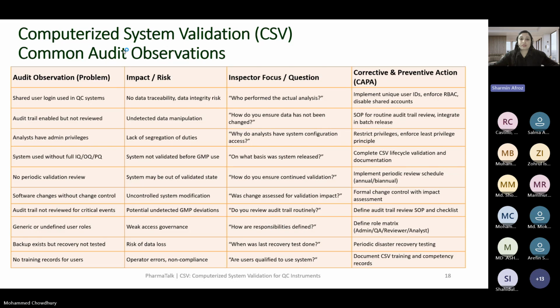And for the audit trail, like policy change and user management change, there will be logs and audit trails, and they put the reason in the audit trail, and it can be routinely checked by QA or the person responsible for audit trail review. There is no such requirement for an outside review. You can read the FDA-provided data integrity guideline.